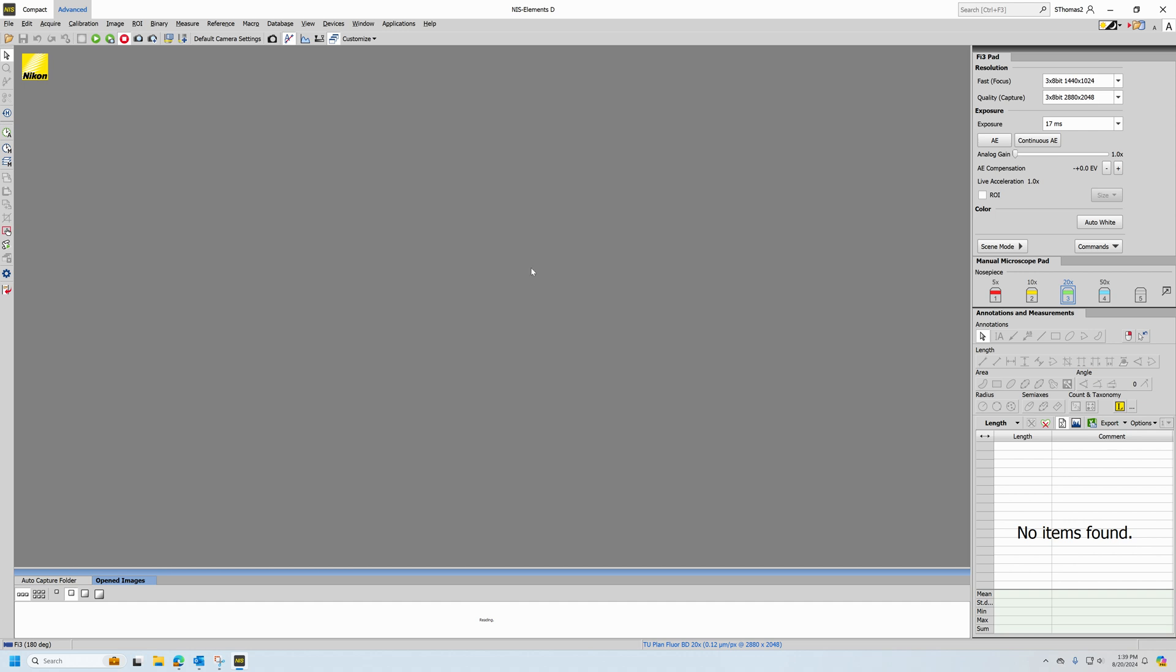In the software, your basic camera controls, your basic microscope pad, and your basic measurements are all located here on this side. Any captured images are located down at the bottom of the screen.